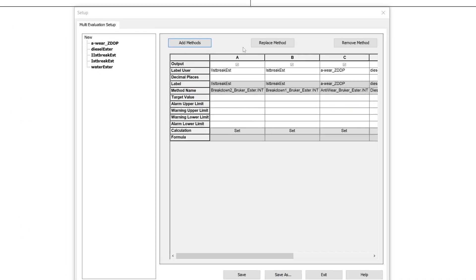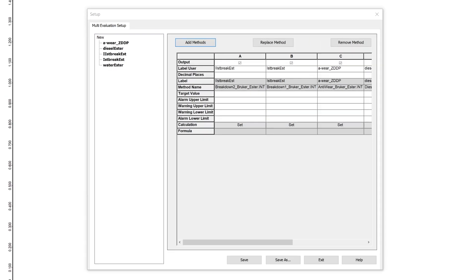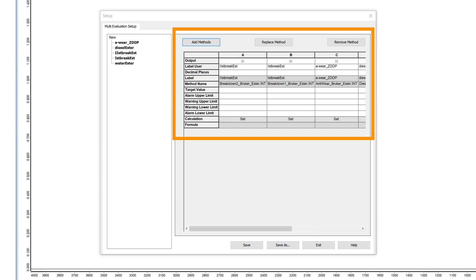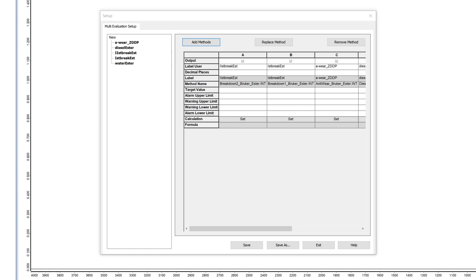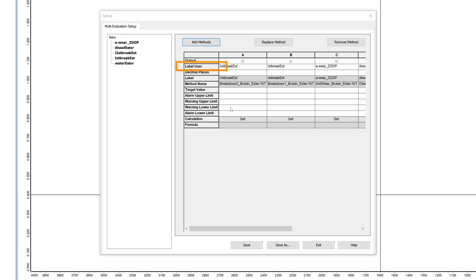Use the replace method button to replace methods or the remove method button to remove them. On the right now you see a table. Each column represents one of the methods. The grey lines are information that cannot be changed because they come from the methods. But on the top of the table you have the line label user.